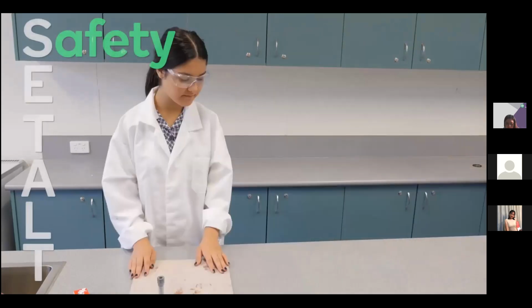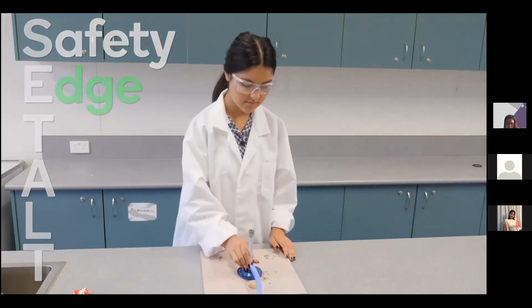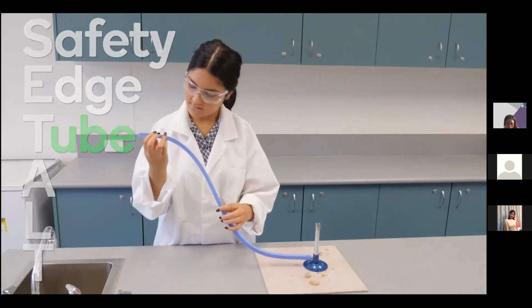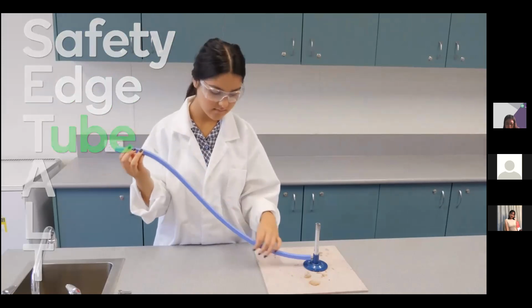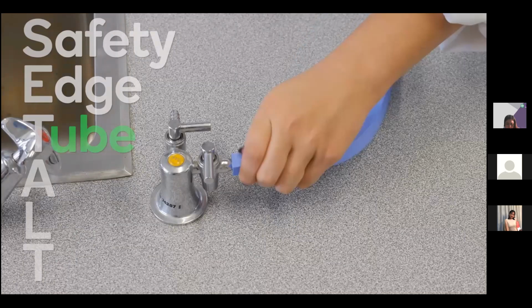E is for edge. Place the burner on a heat-proof mat a safe distance from the edge of the bench. T is for tube. Check that the rubber tube is free of cracks. Connect the tube firmly to the gas tap. Make sure the tap is in the off position. Remember, the off position makes an L shape.